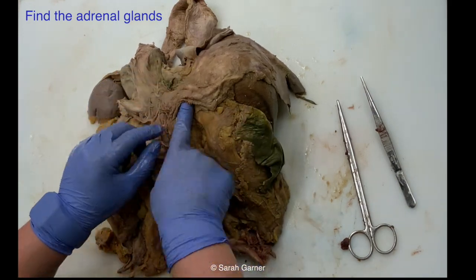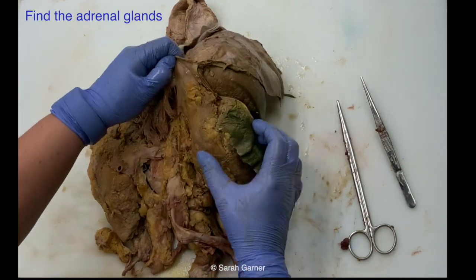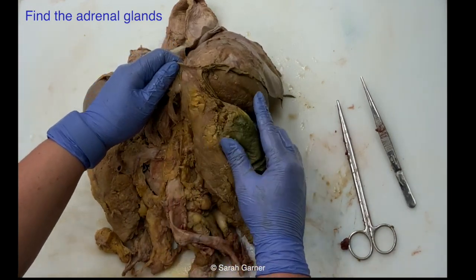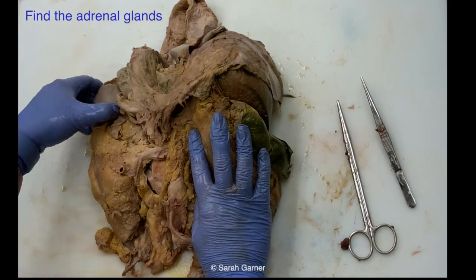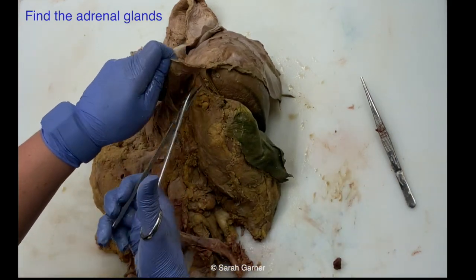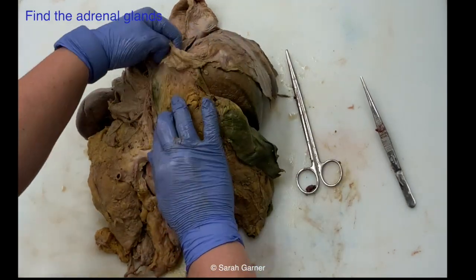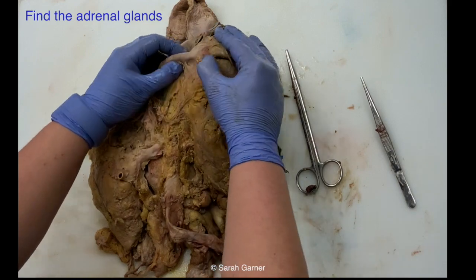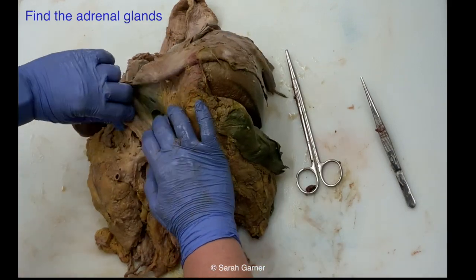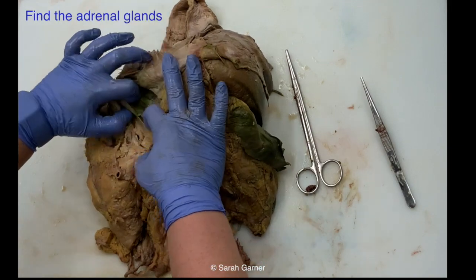Looking here, we have the very end of the diaphragm, so you can get that out of our way. On the right side, you're going to have your liver, and on the left side, you're going to have your spleen. That can always help you orient, especially once you start to remove certain organs, it can get tricky to orient things when it's all fresh and bloody. So we're just reflecting the diaphragm here.